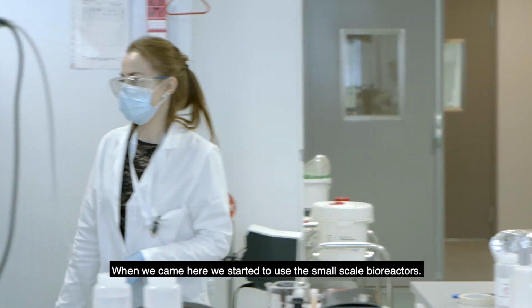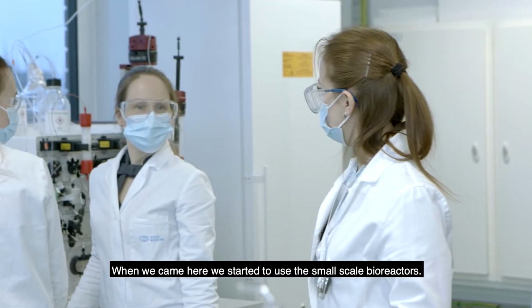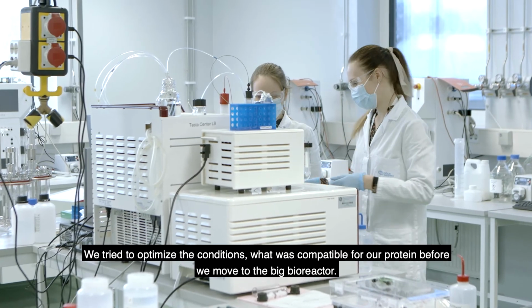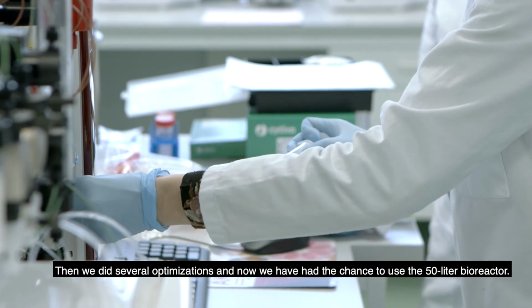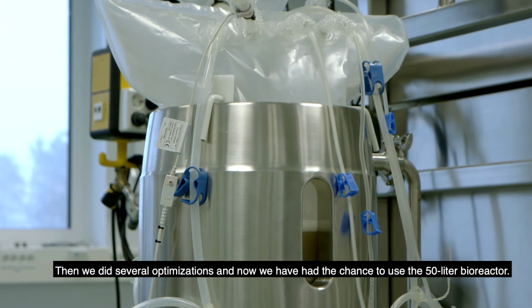When we came here, we started using the small-scale bioreactors. We tried to optimize the conditions that are compatible for our protein before we move to the big bioreactor. Then we did several optimizations, and now we had a chance to use the 50-liter bioreactor.